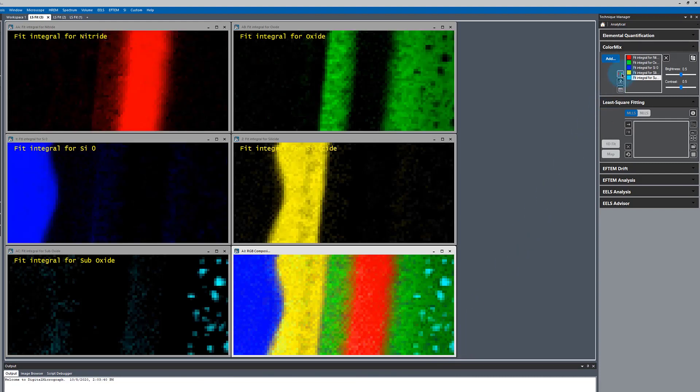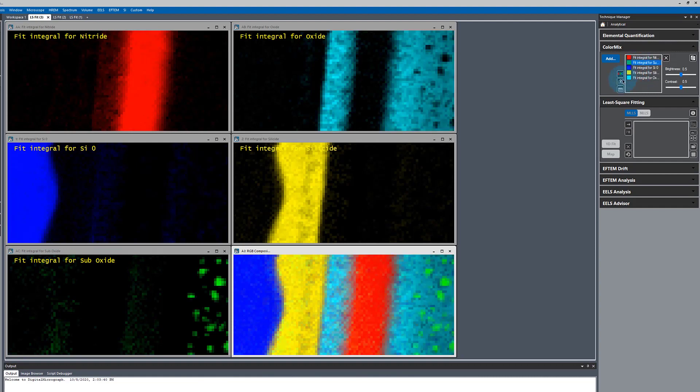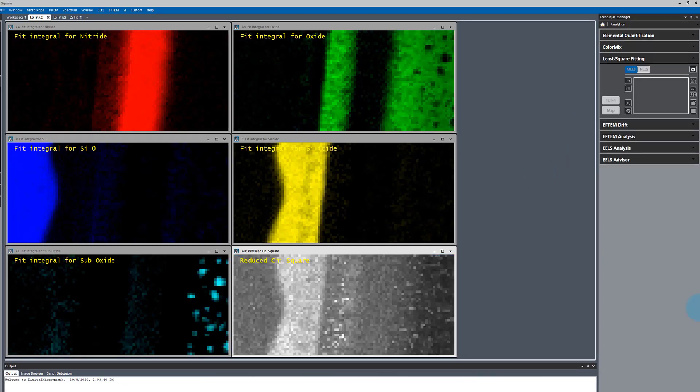We can recolorize our maps. We could consider changing the colors if we didn't like the way the different colors looked.